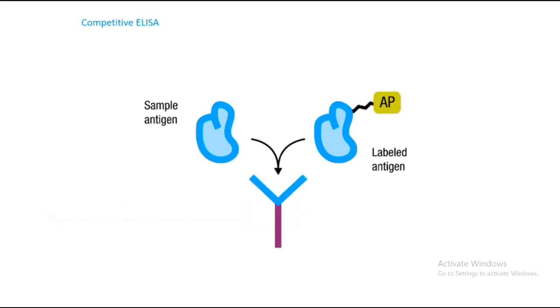So next we're going to talk about a competitive ELISA. The whole concept of a competitive ELISA is that the target or the antigen that you're interested in has to compete with a labeled antigen provided by the company, in terms of competing with the detection antibody.